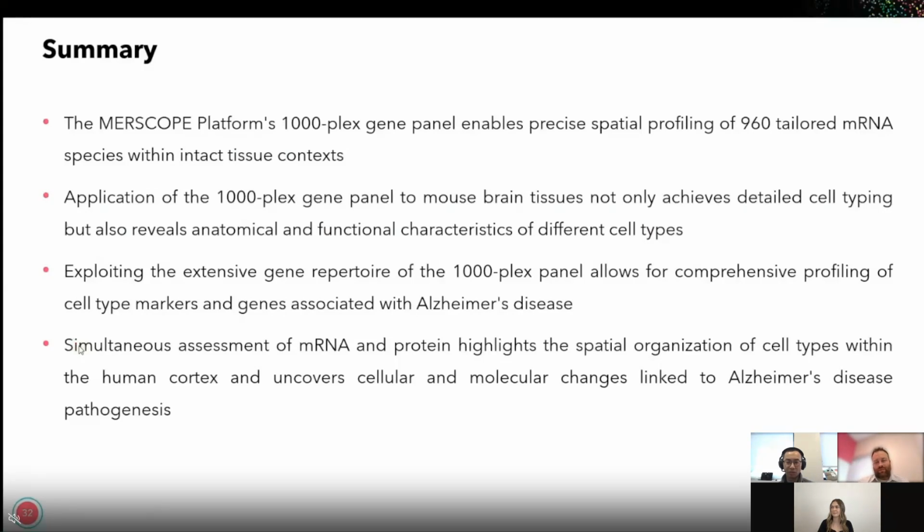I think that's actually an interesting point, because the cells may be not that healthy in that area. So even in the same cell type, the transcript density or the same genes, we can maybe see some difference. Thanks.